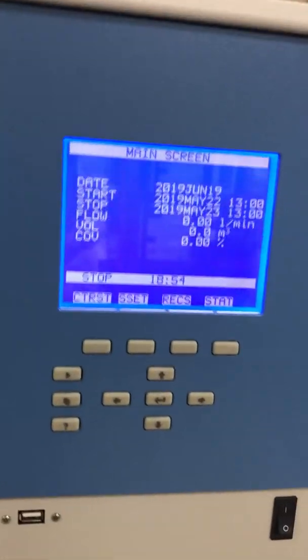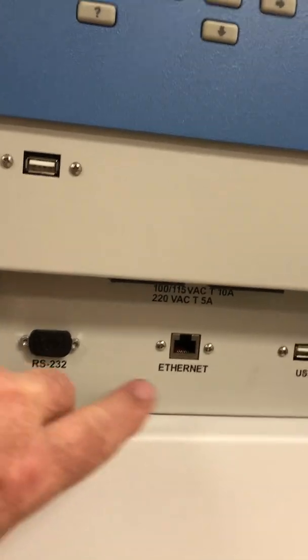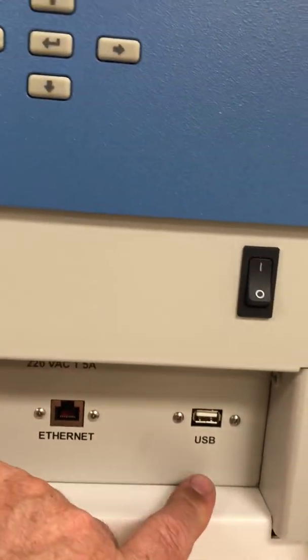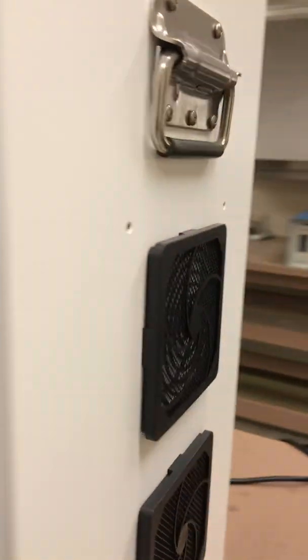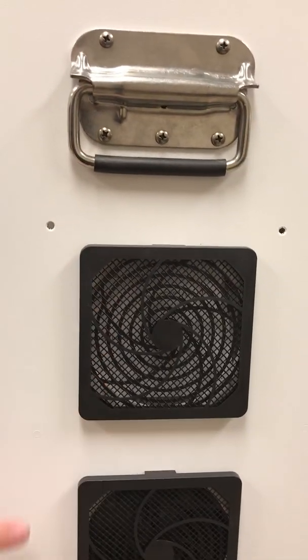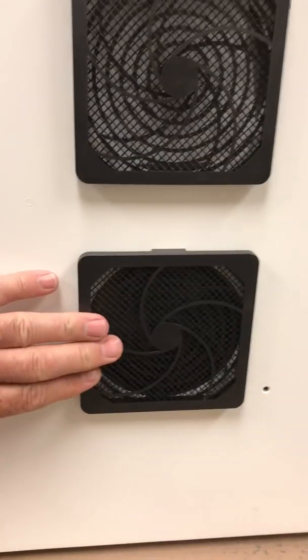This unit has RS-232, Ethernet, and USB for quick data download. Coming around the side of the unit, there are a couple of cooling fans for the housings and the pump cabinet — so the filter housing and then the pump cabinet down below.